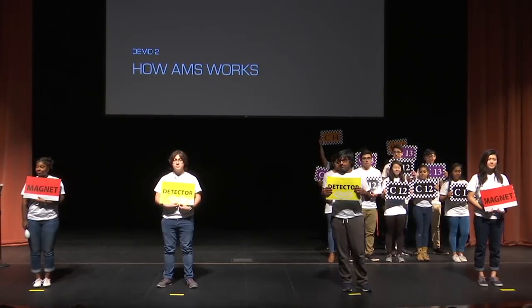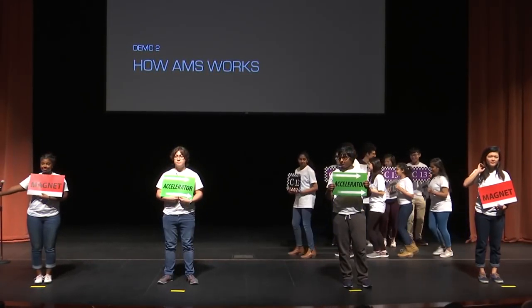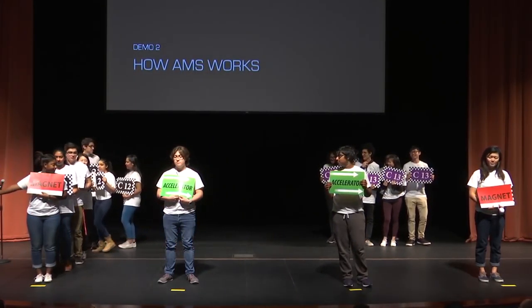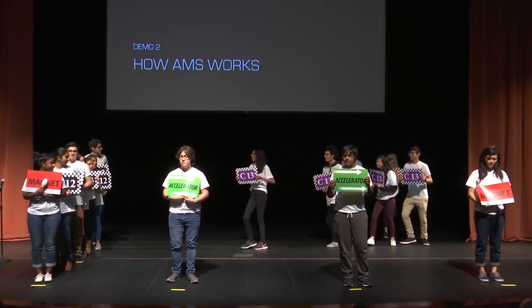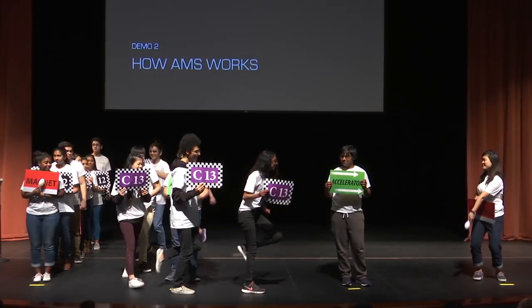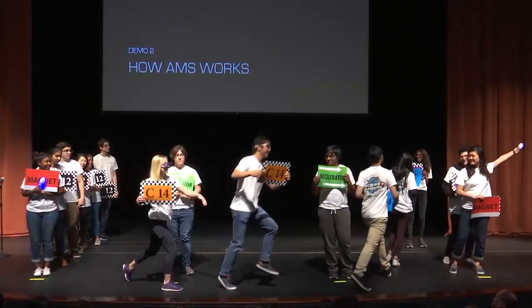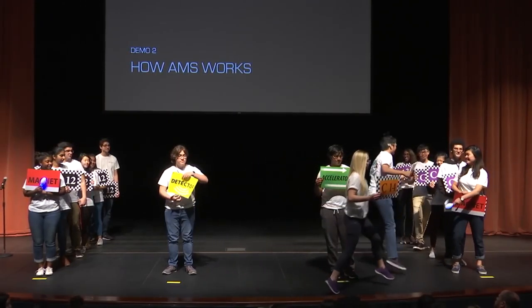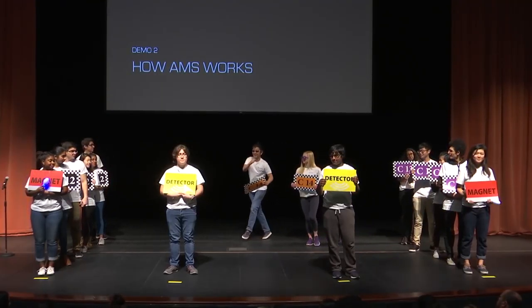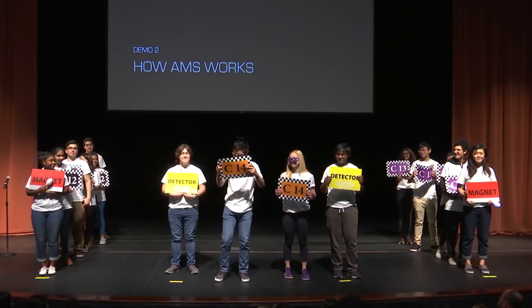Carbon atoms, start your engines. Ready, set, go. And they're off. Oh, super exciting. Look at all those C12 atoms going to the C12 magnet. There are so many C12 atoms. With C12 out of the way now, the C13 and C14 are making the turn with no problem. They're going through the accelerator, and look at that amazing slow-mo action. You can see the atoms move at 1/10 of the speed. Now the C13 are moving toward the C13 magnet, and C14 is ready to go, going around and able to go through the detector without any problems. C14 is going through the detector. Look at that slow-mo action. Very nice. Woohoo! C14 won.